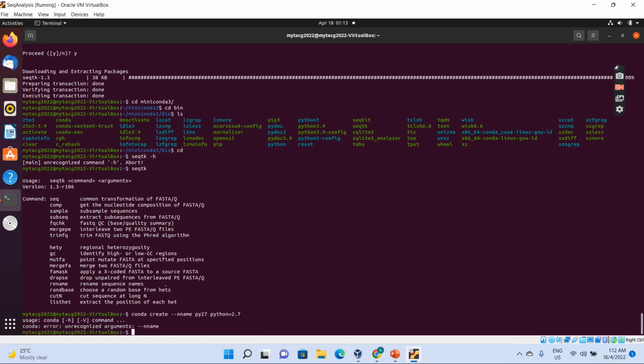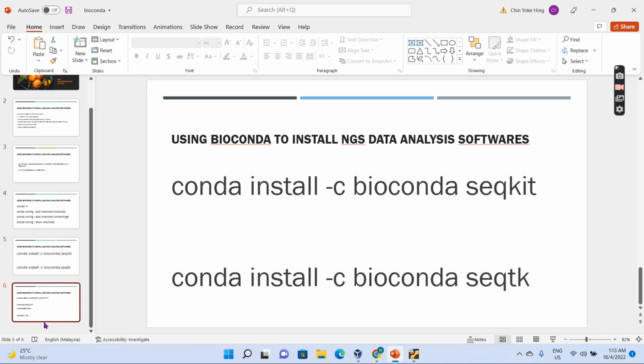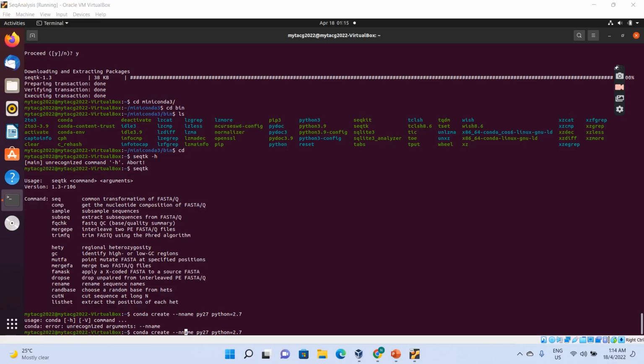Did I do something wrong? Let me check the command line first. Okay, I made a typo here.